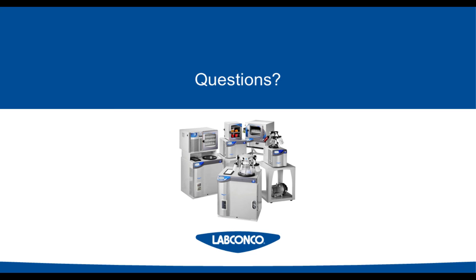Thank you. Okay, and our last question today is, if the samples contain a little organic acid, is it okay for lyophilization?